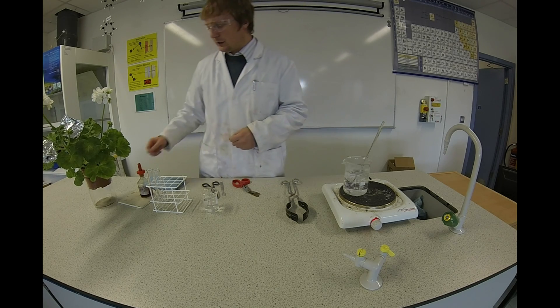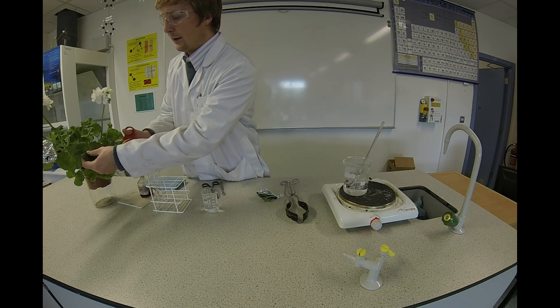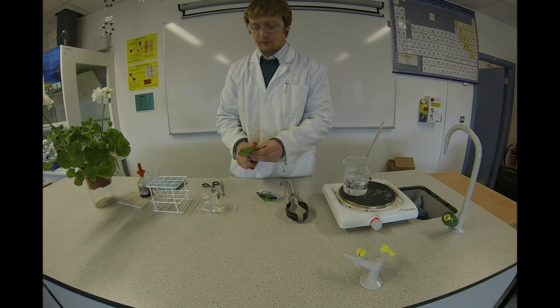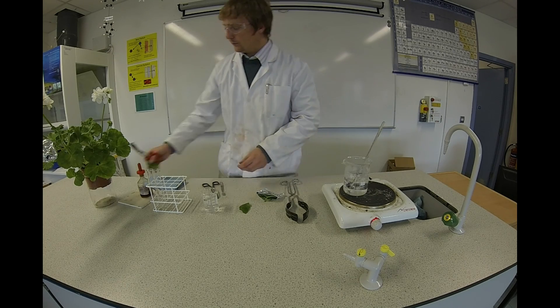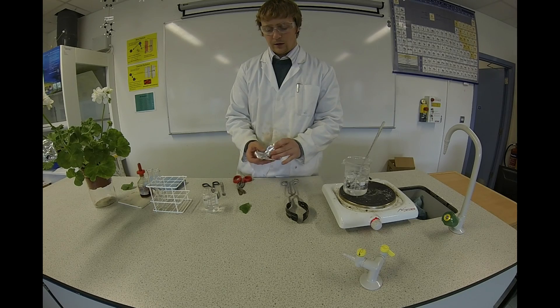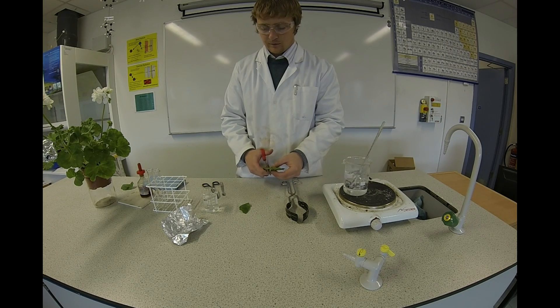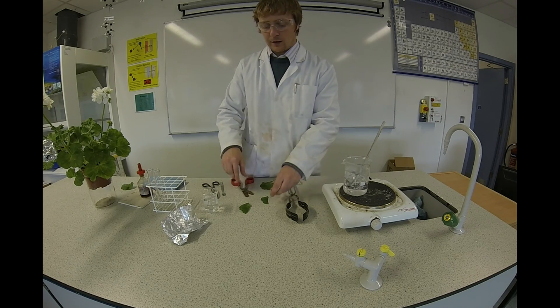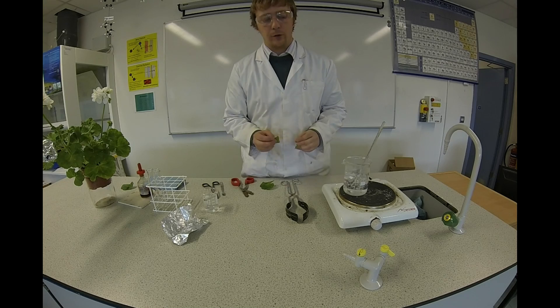I'm going to take a sample leaf — one that was in the dark and one that was allowed to photosynthesize. I won't take the whole leaf, I'll just take a piece of each. So this is the photosynthesizing leaf and this is the non-photosynthesizing leaf. The bigger one is the photosynthesizing leaf and the smaller one is the non-photosynthesizing leaf.